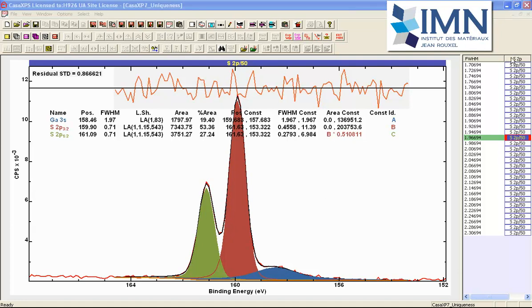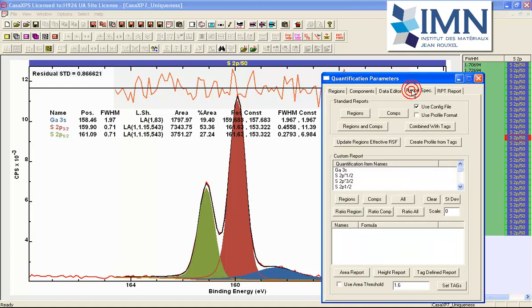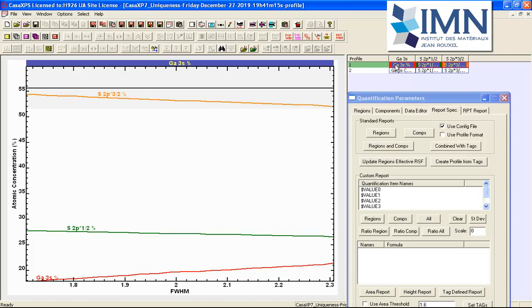To see a plot of how the area is changing, we can use the custom report directly. Selecting all the spectra fitted with this peak model with varying full width half maximum, we go to the custom report, select the components, and choose the area report. Converting the text report, which is plotted as a function of the full width half maximum, and going to the file menu to create a profile, we can see that Gallium area is clearly increasing while the sulfur area is decreasing as a function of the full width half maximum. It is not a large change, but it does show that the choice of full width half maximum makes a difference to the area.